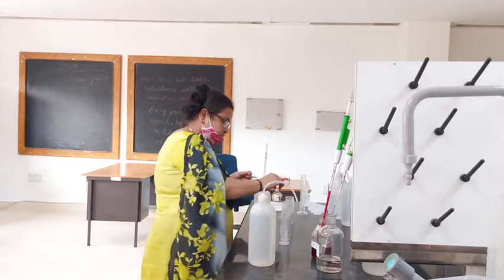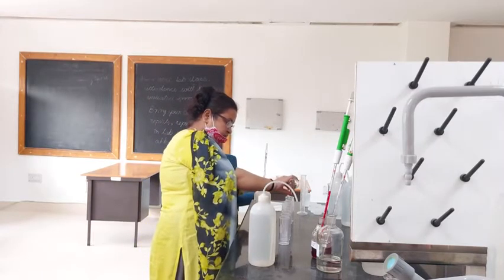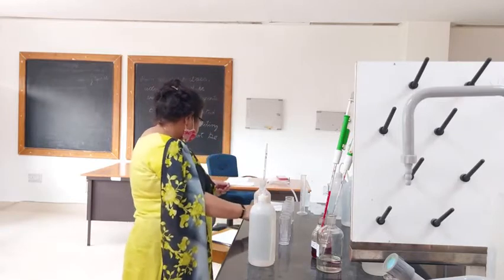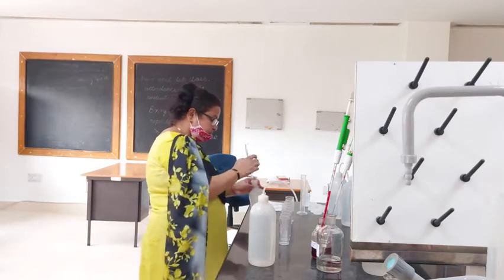Transfer it to the specimen tube. For the next standard, which is 0.8 milligram per liter, we need to take 4 ml.